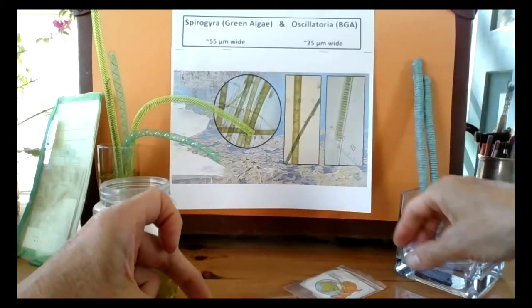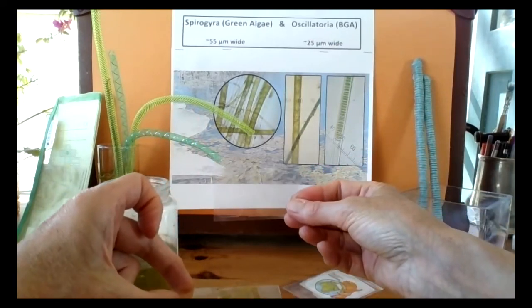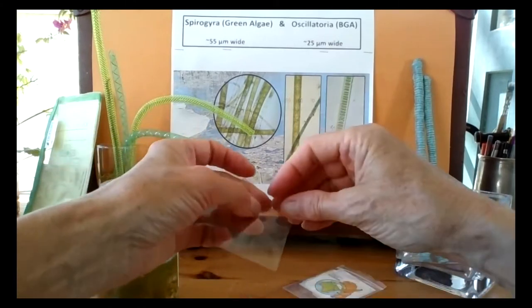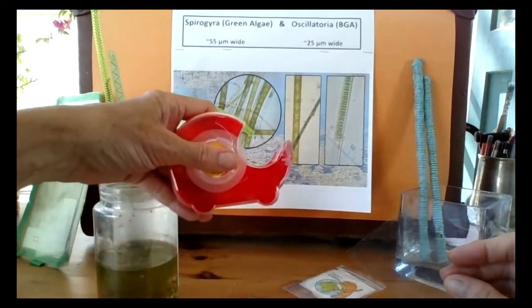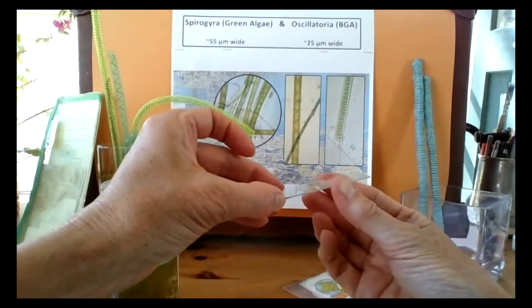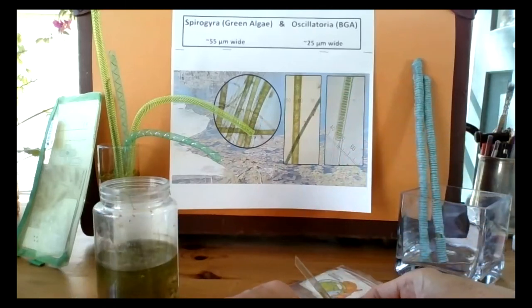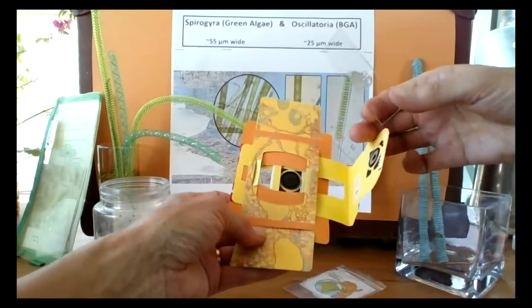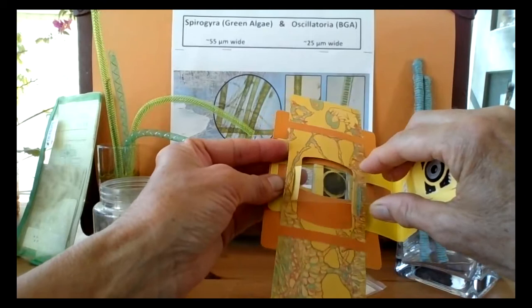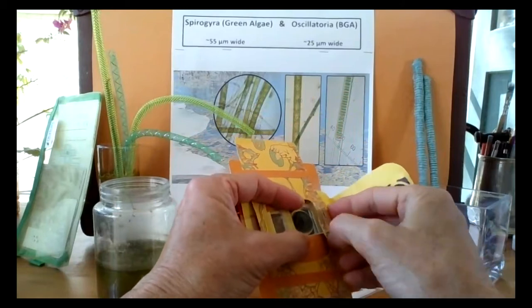And this is where either a piece of tape or you first can use the cover slips that are really sticky tape. When you run out, you can always go to your regular cellophane tape to use as a cover slip. Turn it over, cover slip down, because you're putting it on the bottom side of your foldscope. The yellow side is the bottom side. And then insert your slide, one side, then the other.